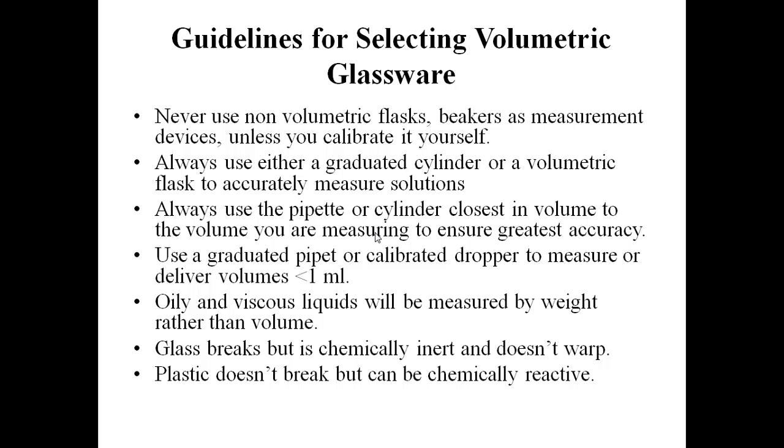Now, what are the different guidelines for selecting volumetric glassware? Which kind of glassware we have to use for measurements, which kind we have to use for storage, and which kind we have to use for the transfer of liquids from one container to another container. There are specific guidelines for this volumetric glassware.